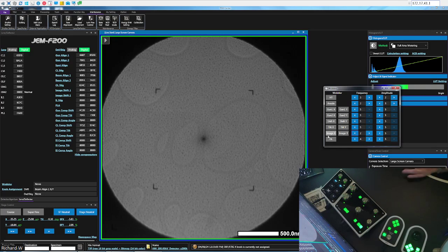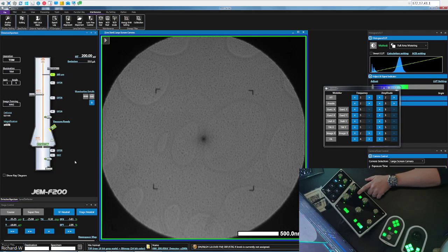So, like I said, I find the image contrast most comfortable to do. So now we've set the sample to the right height, and we've set the microscope to the standard focus condition. So the next step is to do the HT wobble.